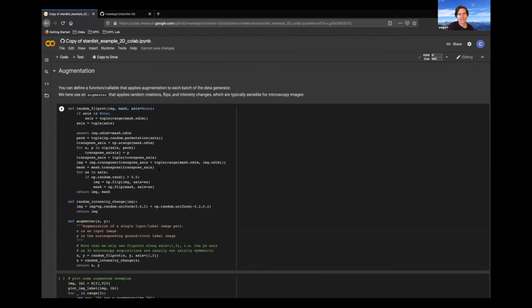Okay, so the next step is augmentation. Although we have 27 stacks, or 23 for training, it's always advisable to do some super basic augmentations. And this includes just flipping your images, like just an axis-aligned flip. So you just rotate it or you mirror it, because your output, like your segmentation, should not depend on whether the image is flipped or not.